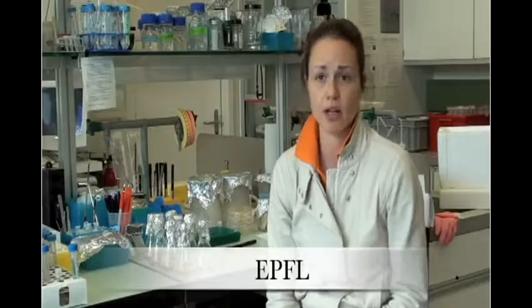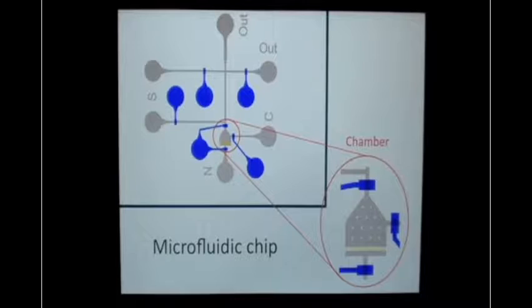For the Life Science project, we are developing a microfluidic chip with the goal to actively maintain bioreporter cells in a microchamber for one week. Using microfluidic valves, every time we need to perform a measurement, we expose part of the cells to arsenic.